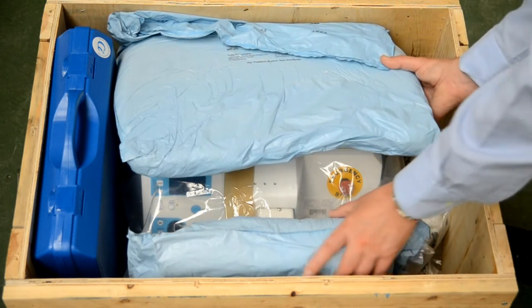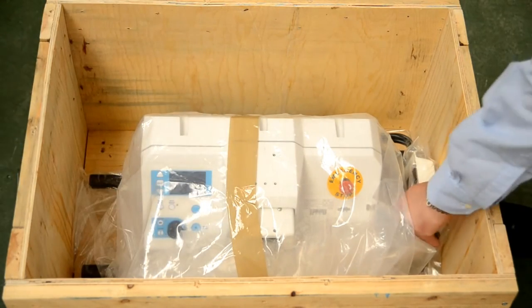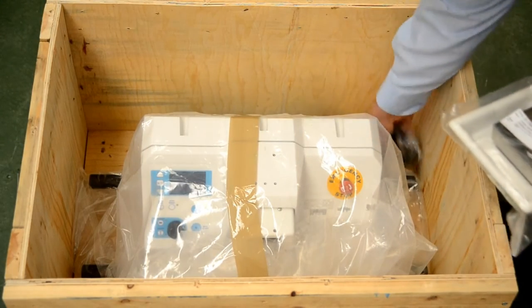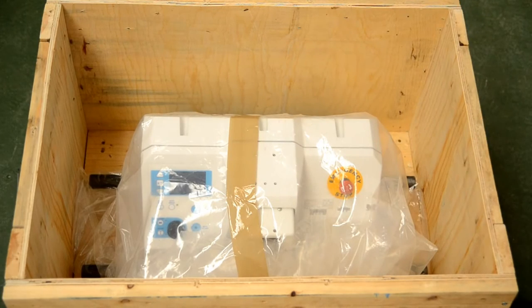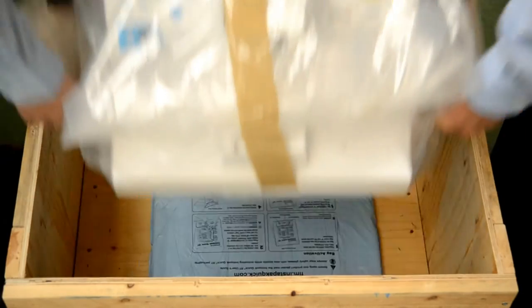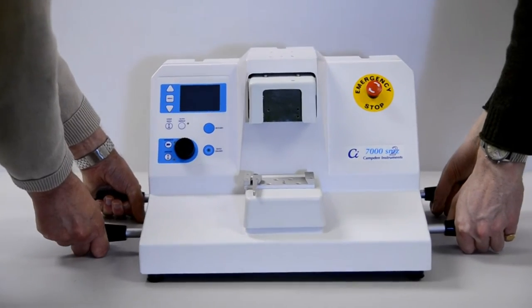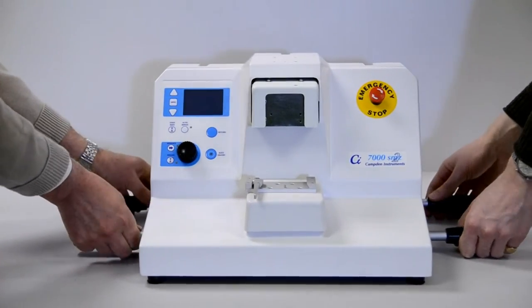The slicer weighs approximately 33 kilograms and will require two people to lift it from its shipping box to the bench. The slicer should always be lifted using the lifting handle supplied. Once the slicer has been placed on a suitable sturdy bench, you can unscrew the lifting handles so that they do not impede use of the instrument or take up too much bench space.